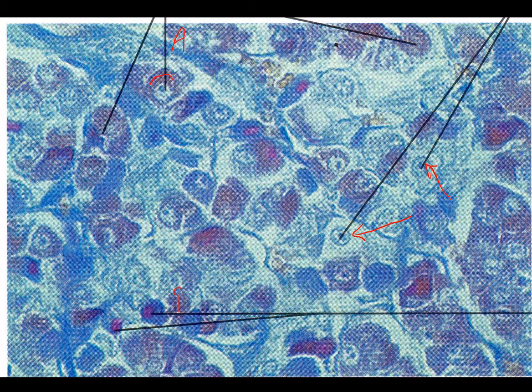And then we have basophils. And so basophils are going to have a blue kind of a hue to the cytoplasm. Here's a couple more basophils. So basophils blue, acidophils red, chromophobes no color to them, and we have our anterior pituitary.